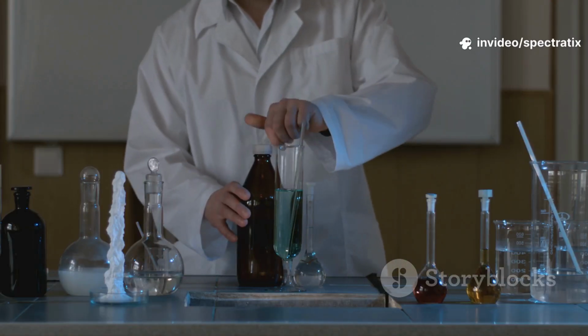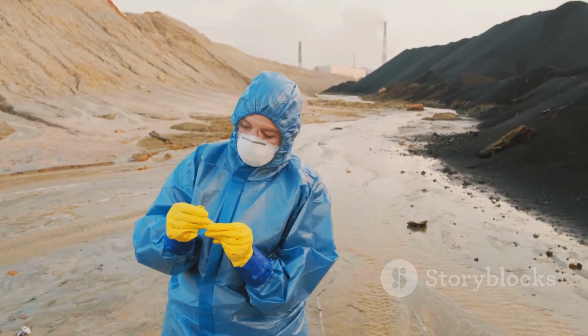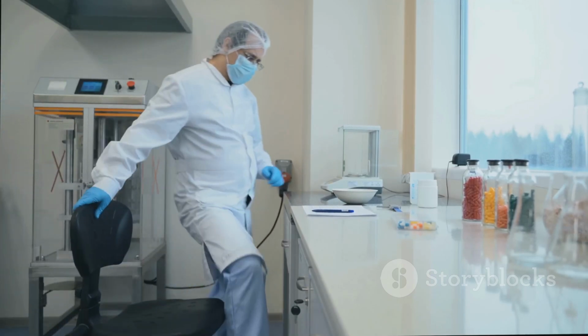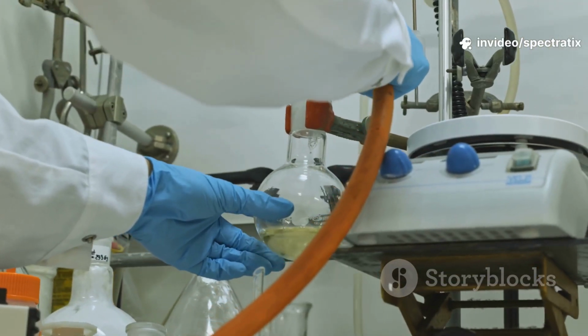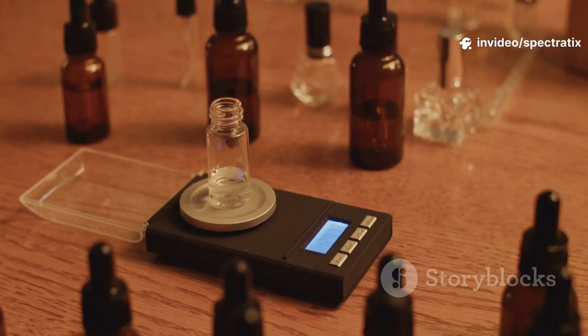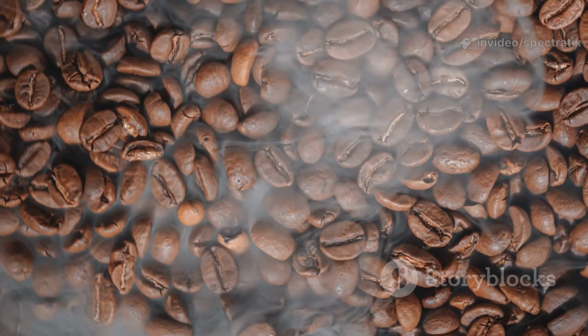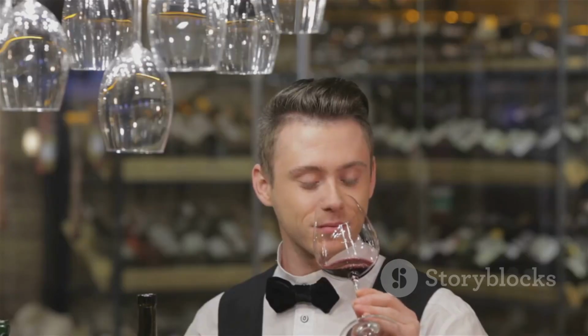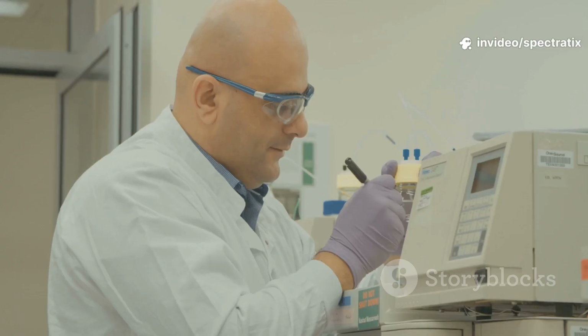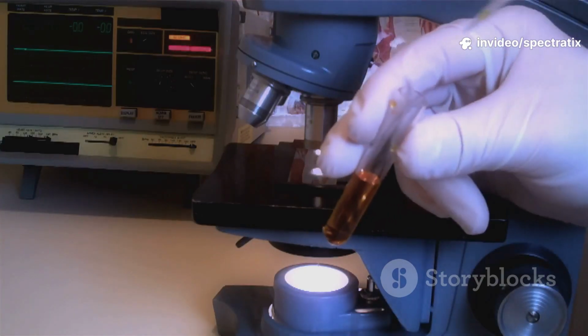In environmental labs, it's used to track pollutants like pesticides or volatile organics. Pharmaceutical labs use it to verify purity and check for residual solvents in drugs. Food and beverage labs rely on GC for flavor and fragrance analysis. Think of how a tiny change in a compound can totally change the taste of coffee or the aroma of wine. And in forensics, GC is indispensable for analyzing toxins, accelerants, and even blood alcohol content.